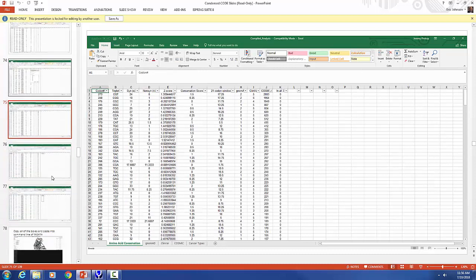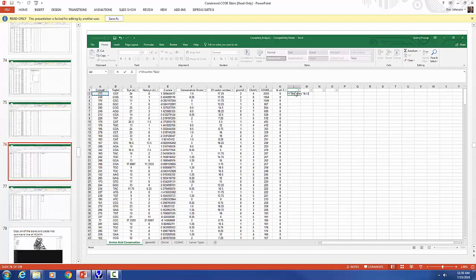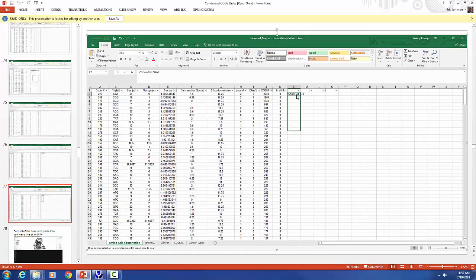And then you can add, in one of the columns, show res as indicated here. So equals, in quotes, show res and A2, which is that cell here. And so it will give you this result in the cell. And then you can drag it out. And so all these results can be brought down into this column here, right?